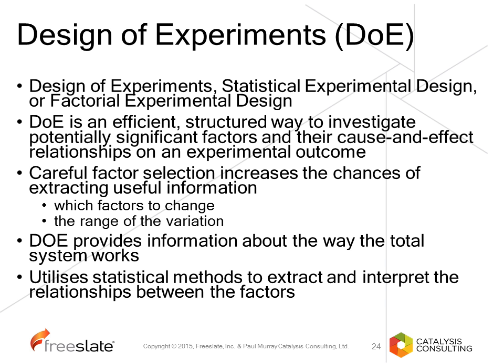If you choose the correct factors, then you will get a lot of useful information from that reaction. The key to success in experimental design is choosing the correct factors and investigating them over the correct range. In my experience, when people come to experimental design and say it doesn't work, it is because they either have chosen the incorrect factors or they have looked at those factors in the wrong ranges. And those are the keys to getting successful experimental design.